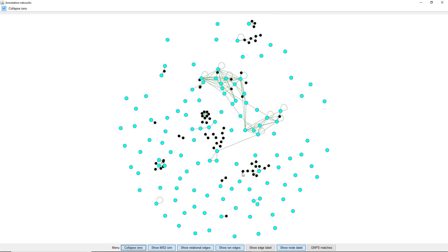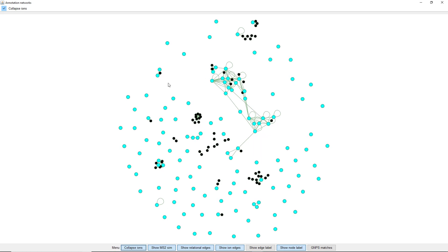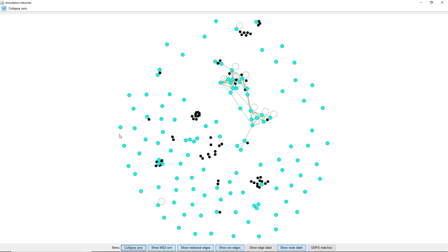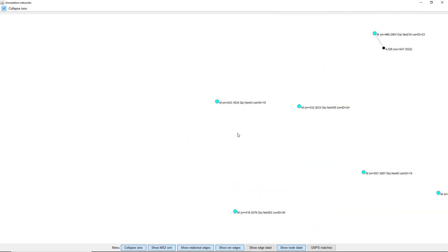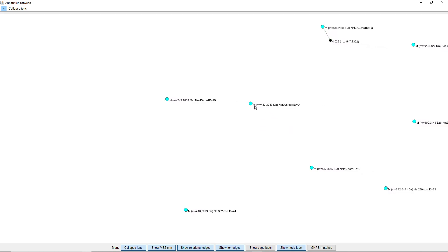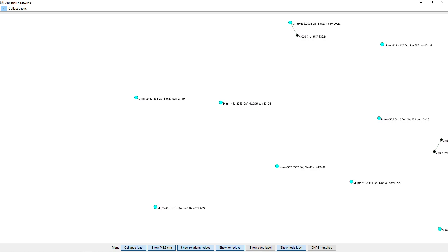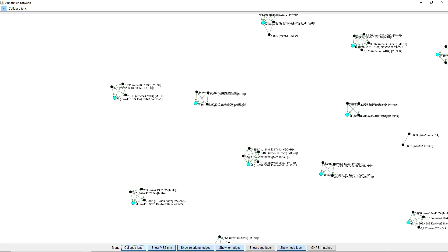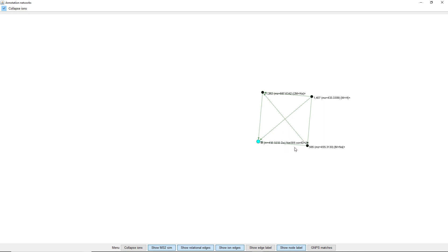Now the graph looks very different because we have two types of nodes. We still have the black nodes — the feature nodes — but we also have cyan nodes. The cyan nodes just tell us the neutral mass, and that they are M — so they are neutral molecules with a neutral mass. We also see the network ID, and if we click on Collapse Ions, we can decollapse the networks.